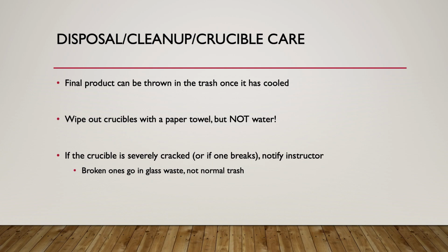And probably the last thing I would mention in terms of your crucibles: if you do break one, and the instructor or TA comes over to help, please tell them whether the crucible is hot or cold, because just looking at it, it's not usually easy to tell. We don't want the instructor or TA reaching down to grab it and burning themselves because it's actually hot and you didn't say anything about it. Hopefully they would use caution before doing that, but it's just common courtesy to tell them whether your crucible is hot or not if something does happen and yours is broken.